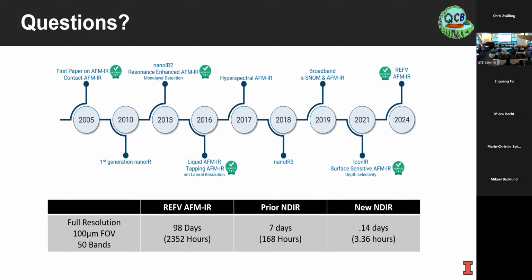But what I sort of missed is the thickness of the samples that you can deal with. Is that at, what did you say, 100 nanometers? Right now we do between 50 and 100. Actually, I don't know, have you measured it? I feel I measured once it was 70, but yeah. 70 we've tried. That's typically what we target.